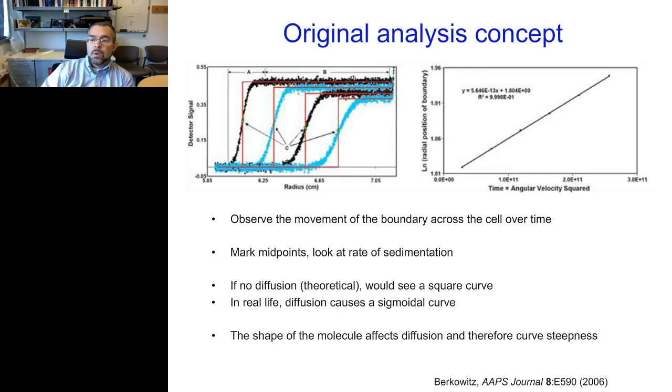All right. We can think about how one would analyze these types of data sets. What I'm showing you here is a simple way to think about it: if you just look at the different boundaries at different snapshots, different periods of time throughout the course of the experiment, what happens is the protein is moving through our sample chamber, and we can very accurately measure distances in millimeters of travel where that boundary has occurred.